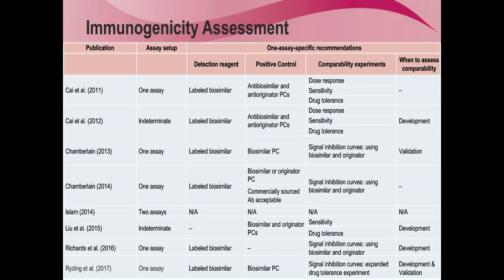This here is simply a literature list showing the different approaches. And you can see that in a relatively short amount of time, for bioanalytical standards, several papers have been published which don't really reach a consensus. But what I want to show you now is our two-stage setup and how to show that, which has also been successful in submissions to European and American authorities.